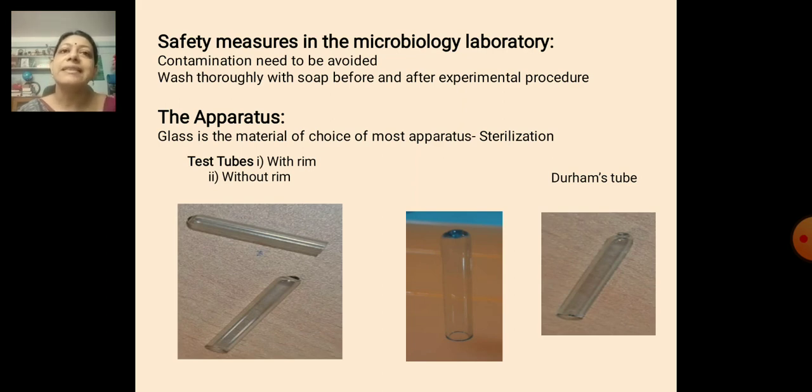We maintain the sterility of this laboratory to a greater extent. For this reason, the first thing when we enter the laboratory of microbiology, we should keep in mind that the laboratory should be free from all outside environment dust particles and other microorganisms that are not required for the study.